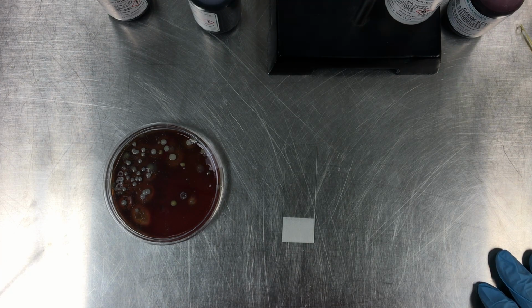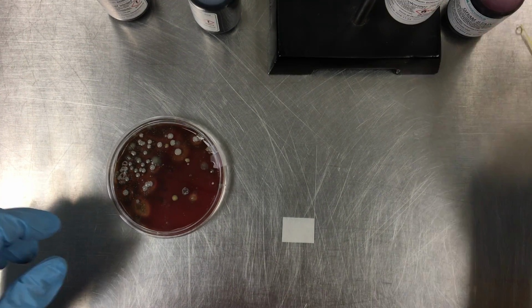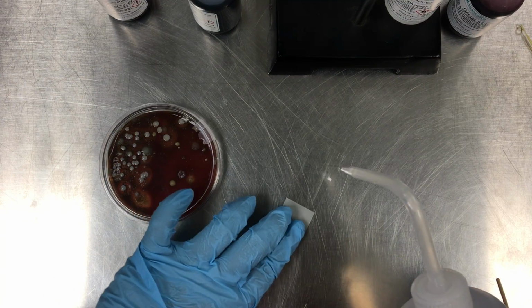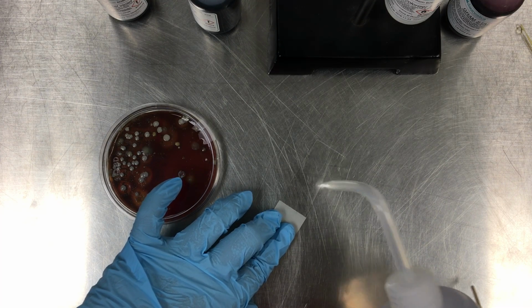To perform a gram stain of an isolated bacterial sample, first you want to take some distilled water and just put a small drop of that onto your microscope slide.